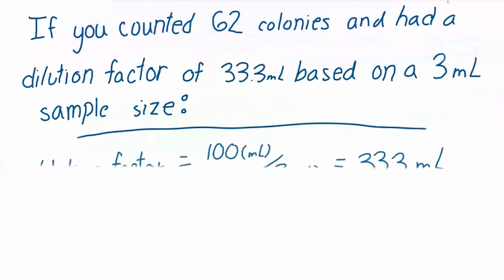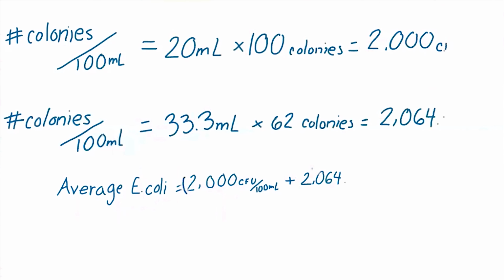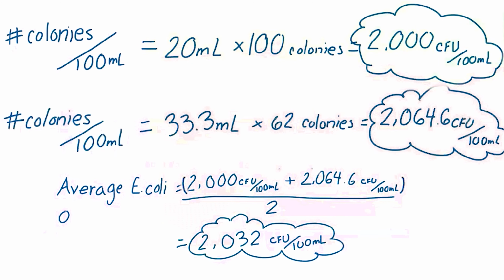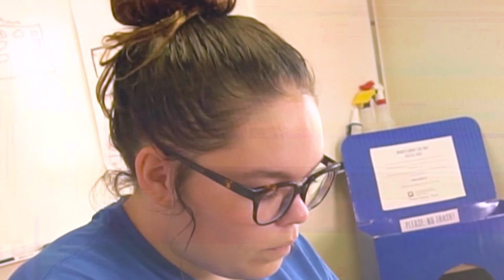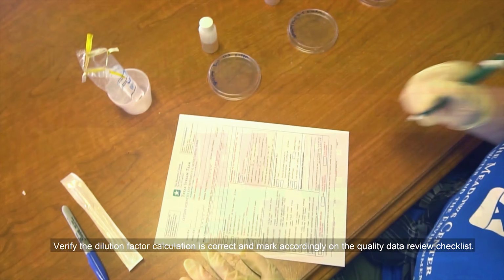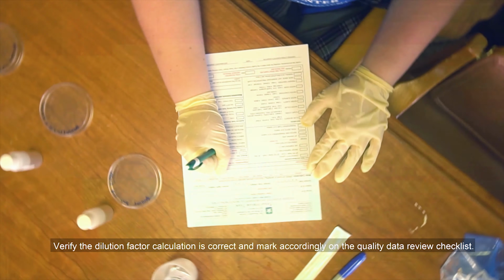Next, calculate the average E. coli from the previous calculations by dividing the sum of the variables by the number of variables. Our average E. coli comes out to 2,032 colony-forming units per 100 milliliters. This information should be entered in the Texas Stream Team monitoring form to document the final results analyzed. Verify the dilution factor is correct and mark accordingly on the Quality Data Review checklist.